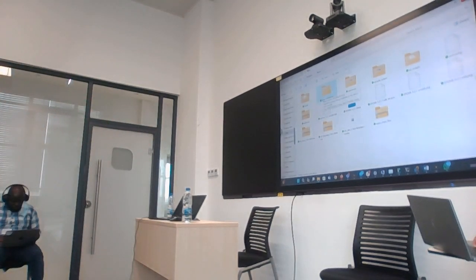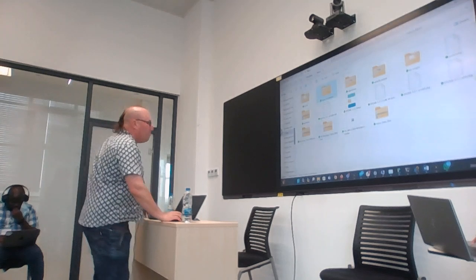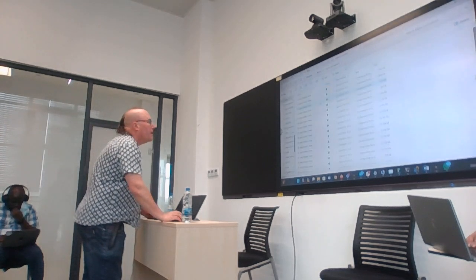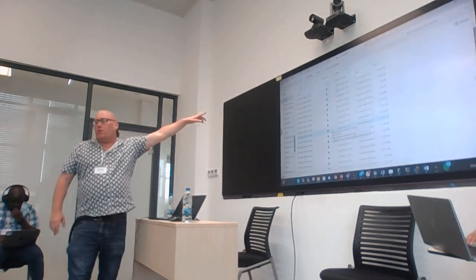When you unpack the data, everybody should have a folder on their computer called MPXV normalized. It is where you unpack the data, so in documents or wherever you happen to unpack the data. Can you look for this folder, please? Inside of this folder, it's got files named like this, SRR something or other.